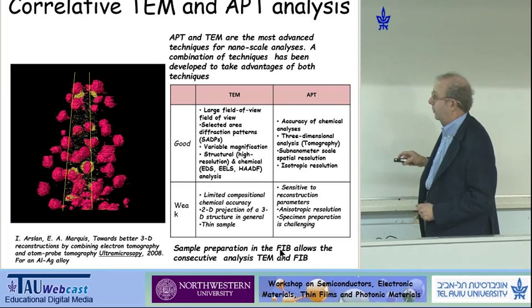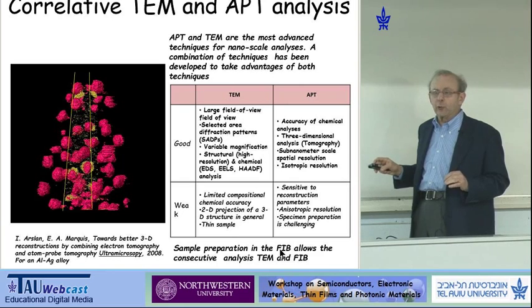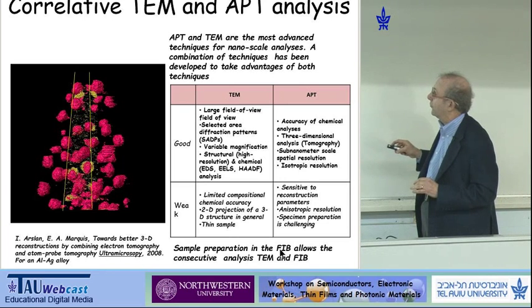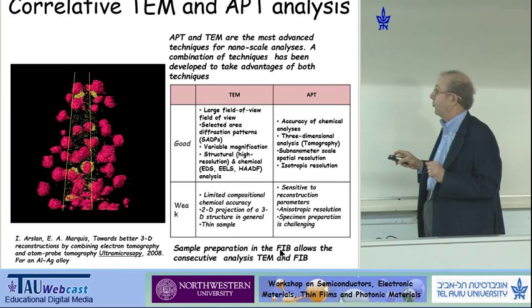What they did is they combined 2 techniques, the atom probe technique with high-resolution electron microscopy, well, really doing tomographic microscopy, and they had a spatial resolution of about 10 nanometers at that time. And this is for the system aluminum-silver, so these are aluminum-silver precipitates, on the same specimen, and where you only see 1 color, it means they overlap, and where you see 2 colors, it means that they're not overlapping exactly in 3-dimensional space.